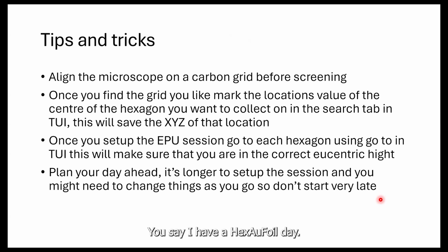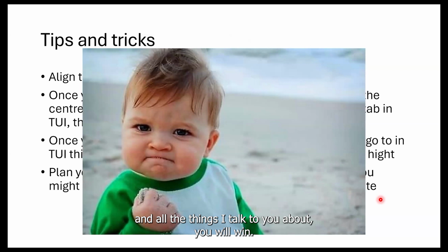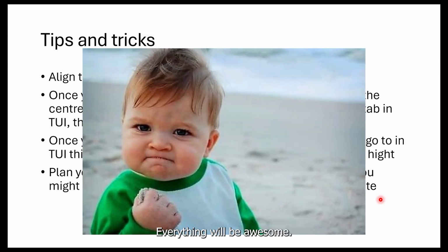You say, I have a HexAuFoil day, I'm in the microscope, full stop. And if you follow all these tips and tricks and all the things I talked to you about, you will win. Everything will be awesome. And I wish you good luck with HexAuFoils. They are an interesting grid to work on. They're not easy, but the results are very good.